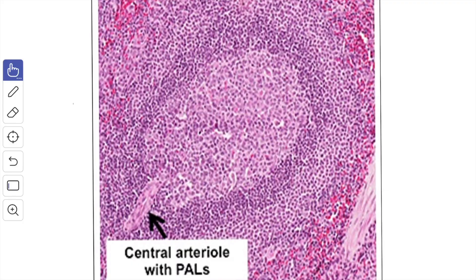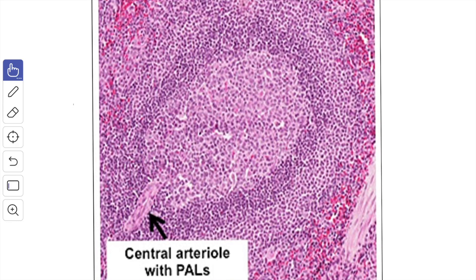This image shows the white pulp. The center is the germinal center, which is a light-staining area where lymphocytes are dividing. The peripheral zone or mantle zone surrounds it. The central arteriole is present eccentrically in the white pulp, and surrounding the central arteriole is the peri-arterial lymphatic sheath, which is made up of T lymphocytes.